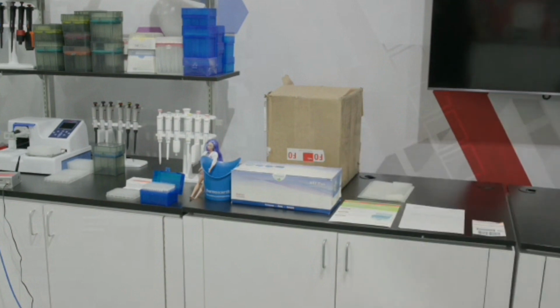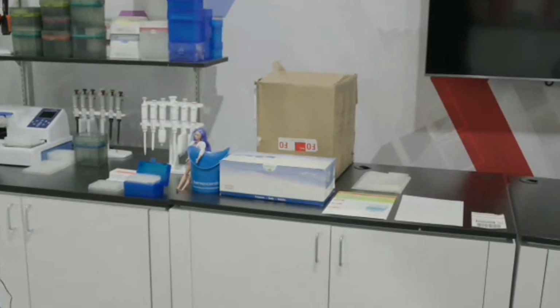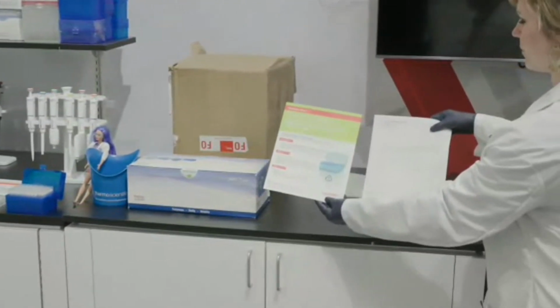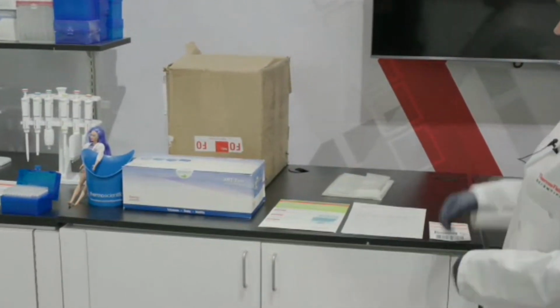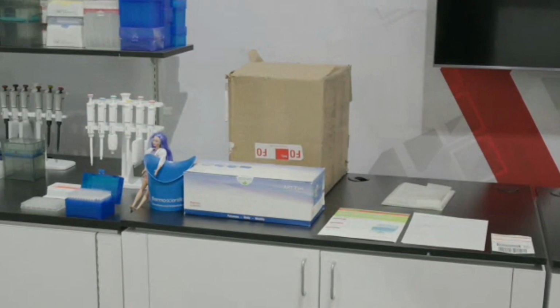So when you receive the product, you're going to have everything laid out to the right of that rack of tips. So you have the plastic insert, the instruction to use, the waiver, the prepaid shipping label, all right there on top. So take that out, go ahead and unpack your tips. You can sort your racks, get them to wherever you need to in the lab, whoever wants to use them. And then it's going to be as simple as open up the box.